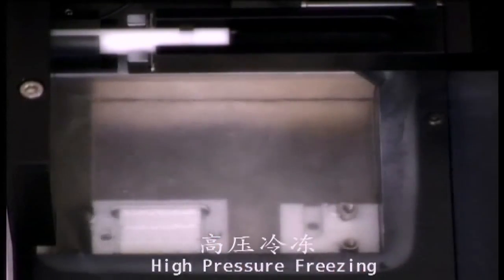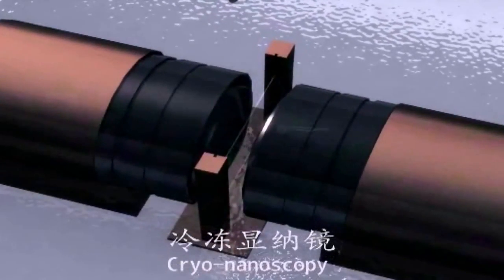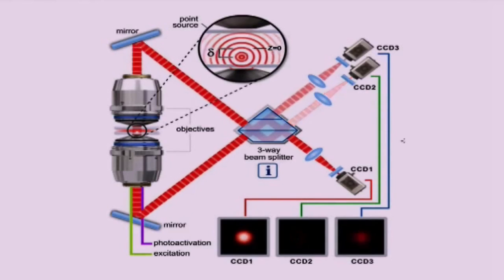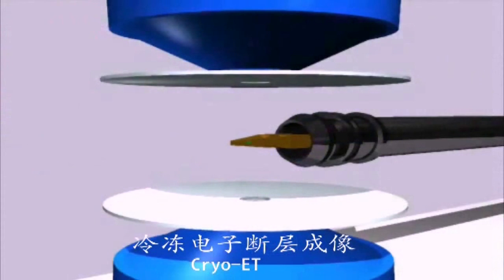So basically, we are trying to freeze the sample, then get to the actual thin section and put them in EM grids. Then the first thing is to visualize them in the light microscope, trying to localize it. Then put it into EM.